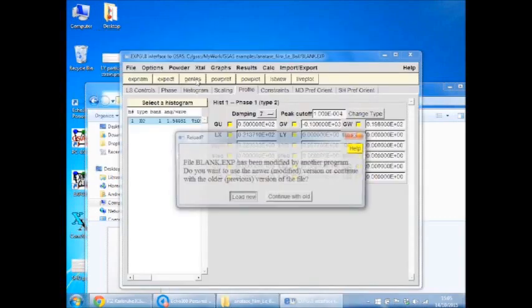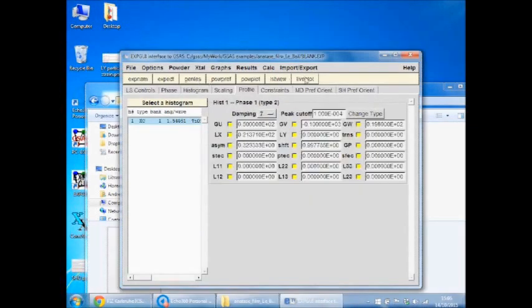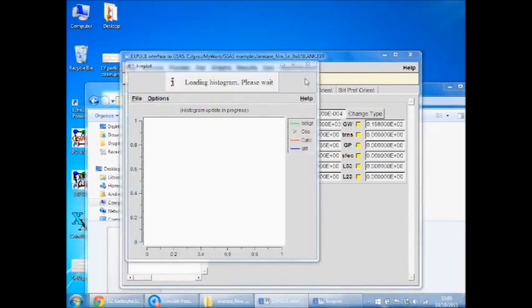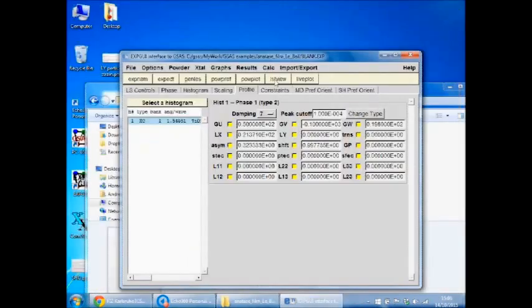I don't know if it worked. Oh, it has worked. Okay. Oh, it's fine. We'll get everything back.